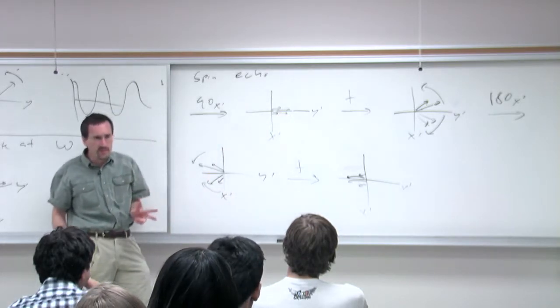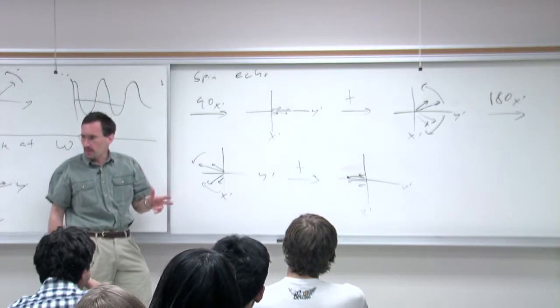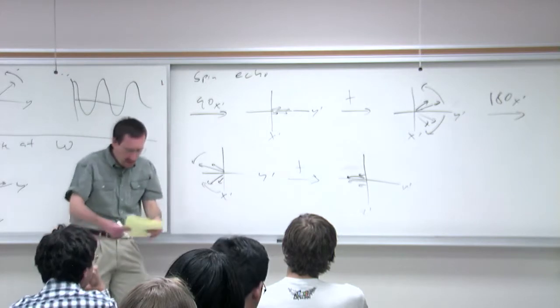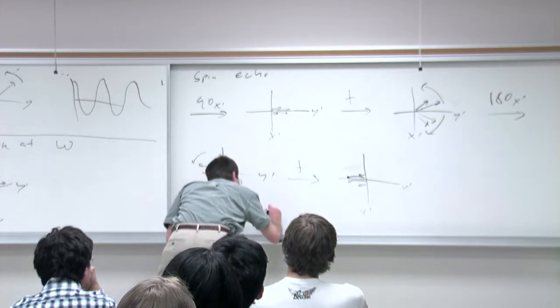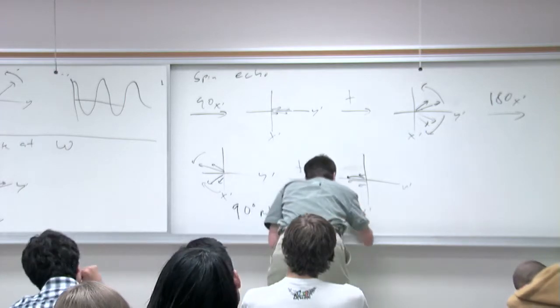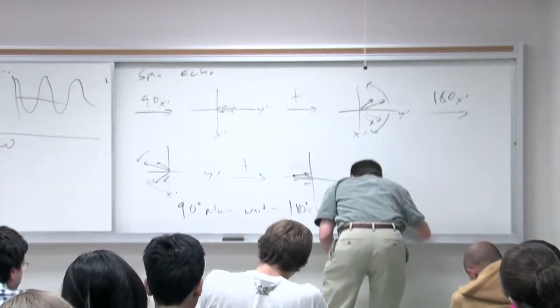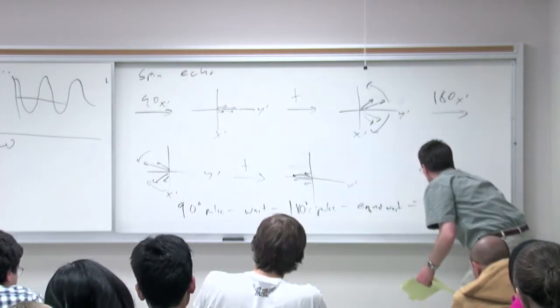And so almost every experiment you see, the ones I'm talking about now, but also 2D experiments, are going to involve some sort of a wait and then an equal wait. So if I write out this simple pulse sequence, we apply a 90-degree pulse, we wait, we apply a 180-degree pulse, we have an equal wait, and at that point, the spins refocus.